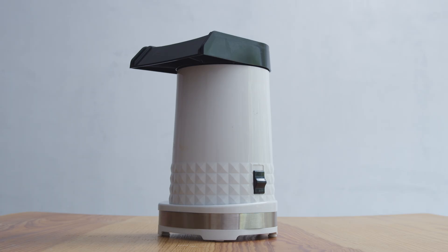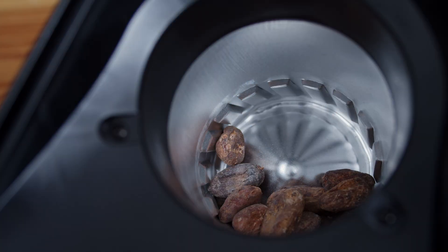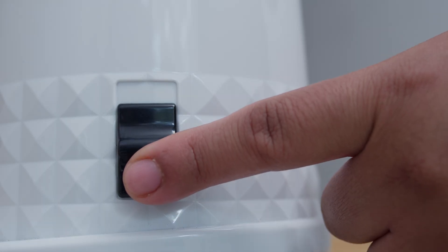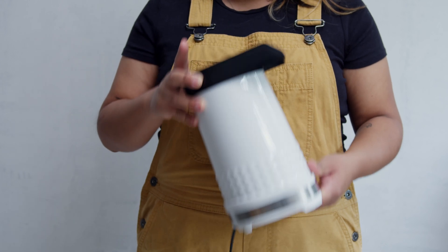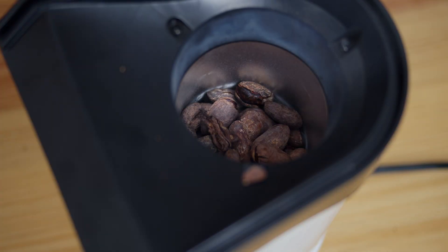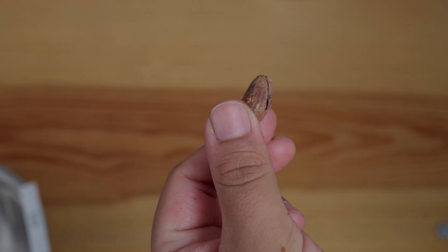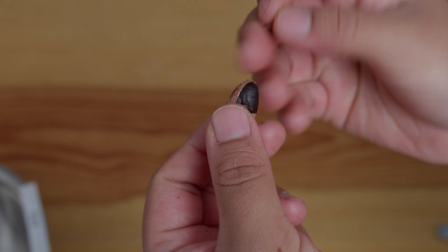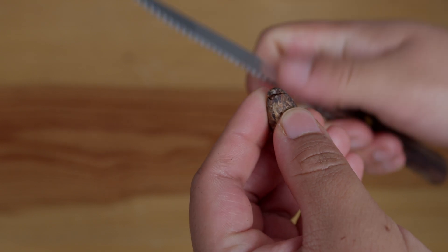Step 3: loosen the shells of the cacao beans. If electricity is available, loosen the shells by puffing the beans in a popcorn popper for a maximum of 60 seconds. Agitate the popper during this period to continuously minimize the heat exposure of the beans. Note: this introduction of heat does not roast the beans; instead, it reduces moisture for the ease of removing the shell. If electricity is not available, use a nutcracker to slightly crush the beans and loosen the shell for easier peeling. A knife can also be used to loosen the shells.